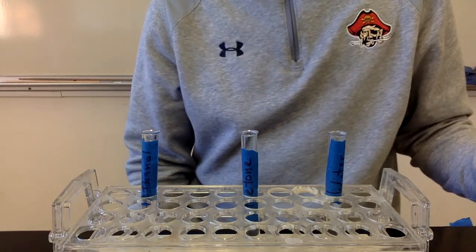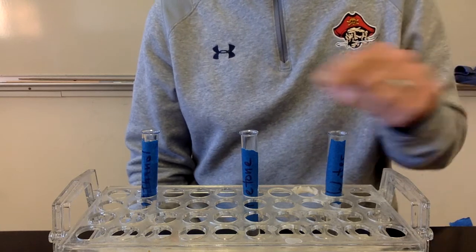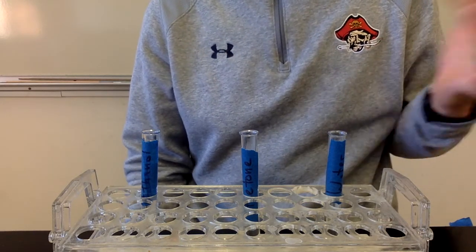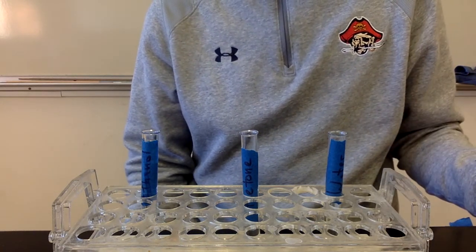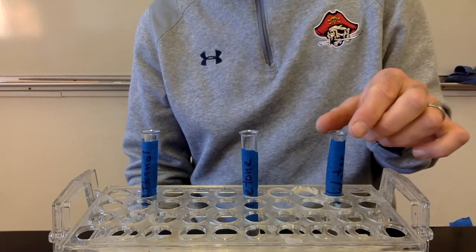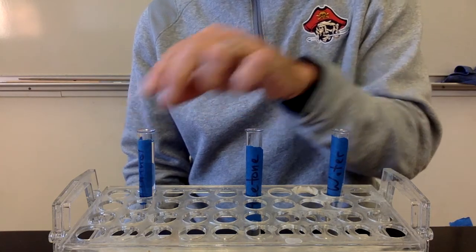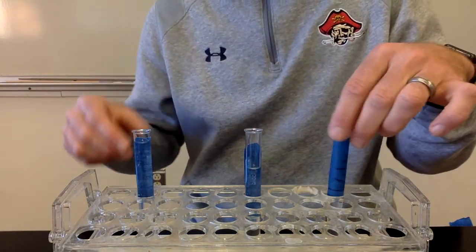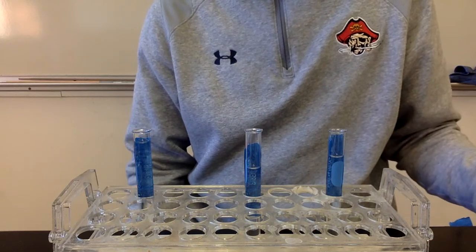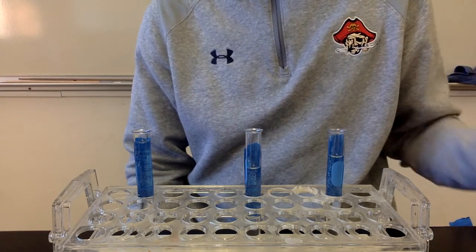What's up, guys? This is our enthalpy of vaporization lab, where we're going to look at three different liquids and look at how much energy is absorbed as they evaporate, as they turn from a liquid to a vapor or a gas. So we've got water, acetone, and ethanol, and you can take a look at them. They're all clear liquids. They all look kind of the same. They're all the same state. They're all at room temperature right now.